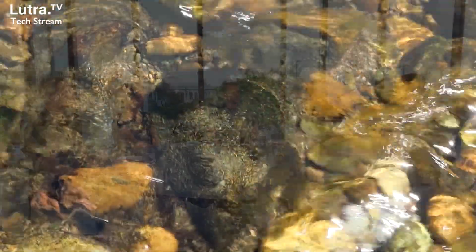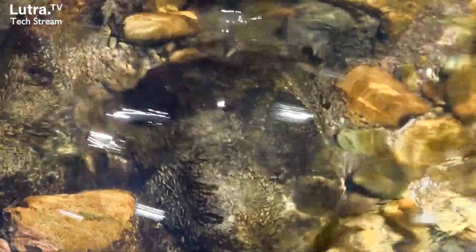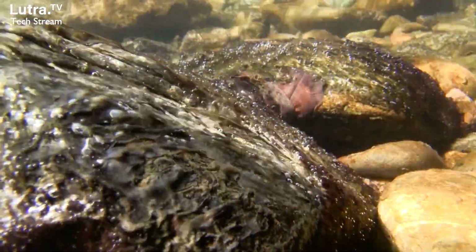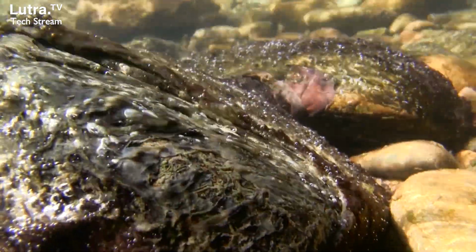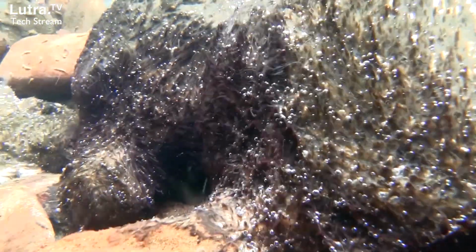The most common one that we have here is called Microcoleus, and it looks brown, black coloured and quite different from green algae like Spirogyra, the long filamentous algae that you might have in a river, or a diatom mat, which will be quite a light brown or a little bit fluffy even.